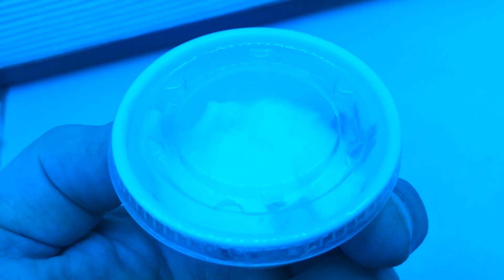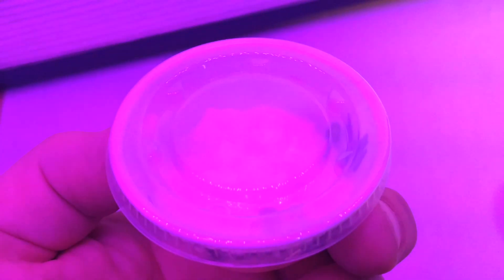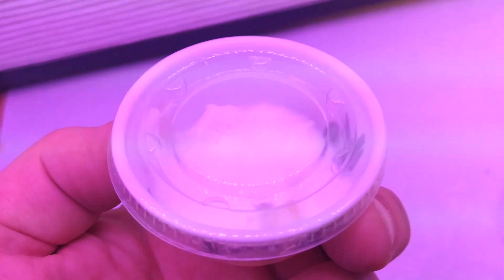Which if you change the colors you can see different things happening with your mycelium growth.